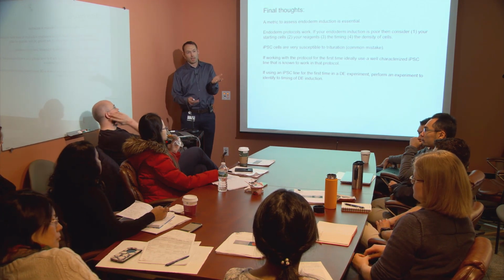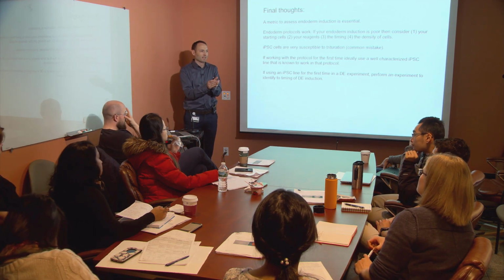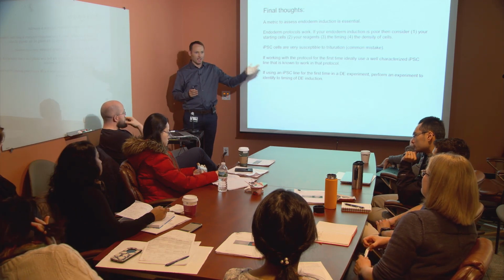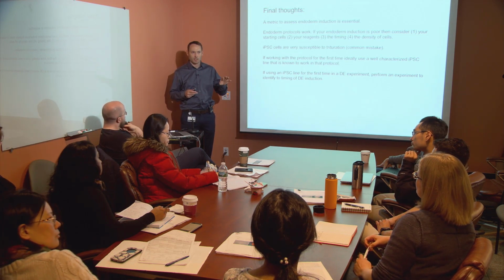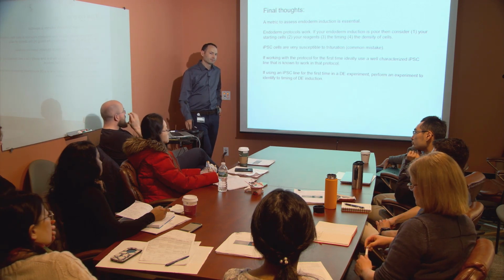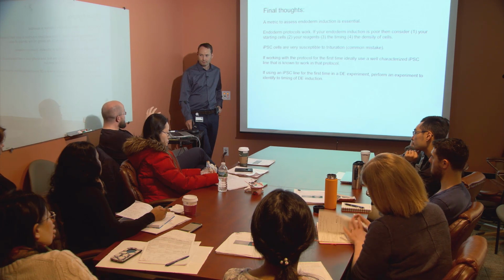And you would think that if you sort cells on day 15 and 99.9% of those cells are pure, that they would stay that way. But we don't have the perfect recipes yet. So we actually find that 2 weeks later, despite that sorting step, we do have a minority of cells that are not lung, but we've highly enriched. Have you had any success in maintaining them and expanding after you sort the NKX2.1?